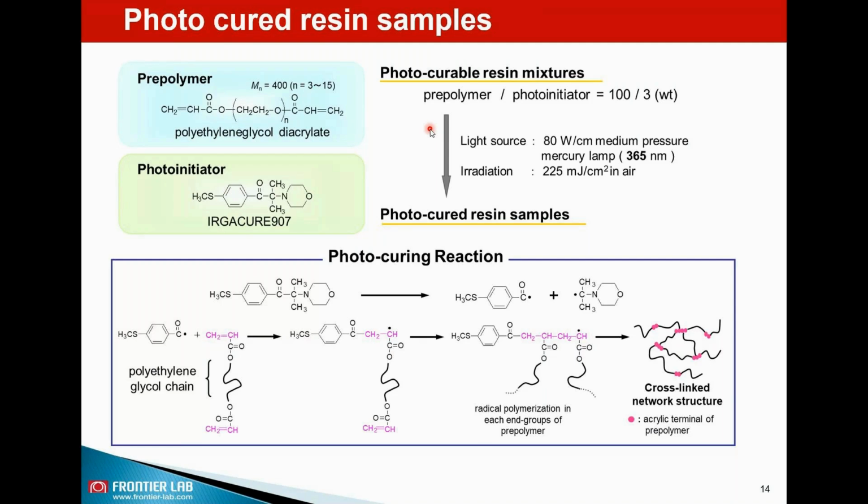or demonstrate with this application. Okay, as we know the photo curing reaction, so you have this photo initiator. When they get exposed to the photo light, they usually form these free radicals, and these free radicals react with the polymer, this polyethylene glycol, and they actually form these cross-link and network structures. Okay, so based on this networking structure, one can really assess the durability of this material.